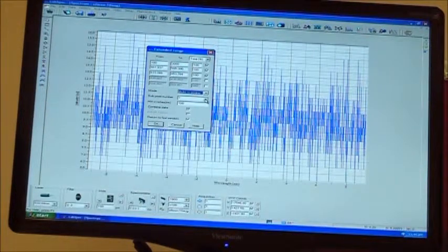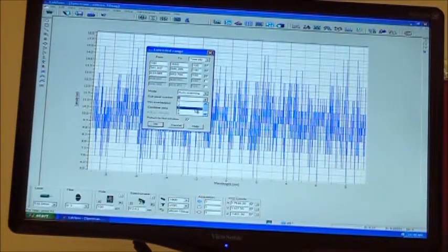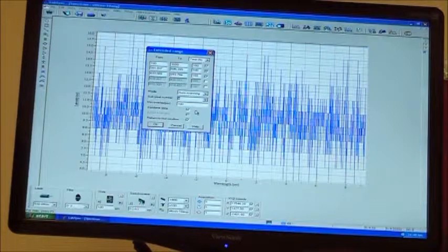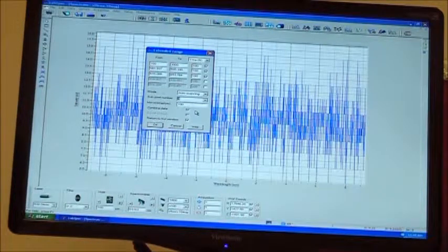Then, if you need even better data, you have subpixel numbers. Now what these will do is they actually divide the pixels up into even kind of like microscopic pixels. So if you set this to, for example, a subpixel of 4, when you do your auto scan, it'll hit all the pixels, then it'll move like a quarter the width of a pixel. And you'll still hit the first pixel, but now you'll hit a quarter of the first pixel. Is it the CCD pixel?